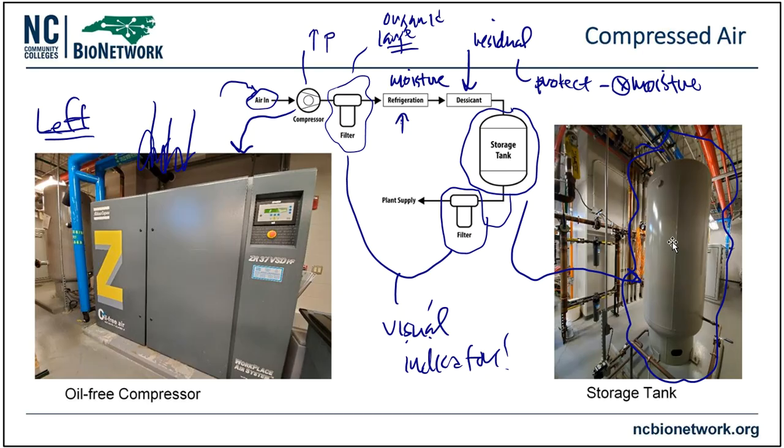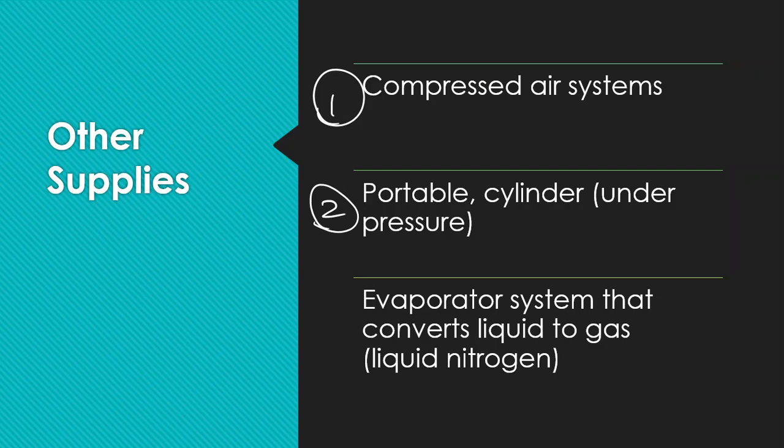You can often wheel them up with some type of dolly, put the gas tank on the dolly and wheel it out of the room, bring the new one in, transfer it from place to place, whatever the case might be. Those portable cylinders can also be used to supply gases. You can order these portable cylinder gas systems, what we call 5-9ers, 99.999% pure. And very often analytical laboratories have to have this type of purity in order to do some of the testing that they've got to perform. That's kind of the lingo.